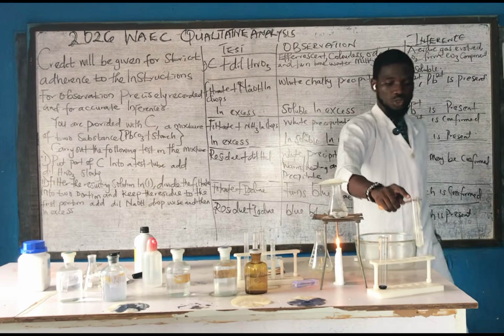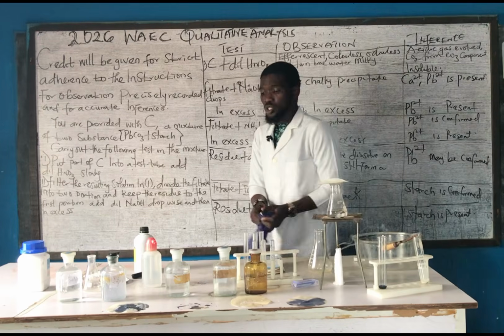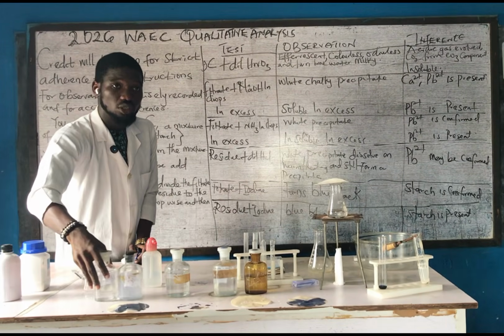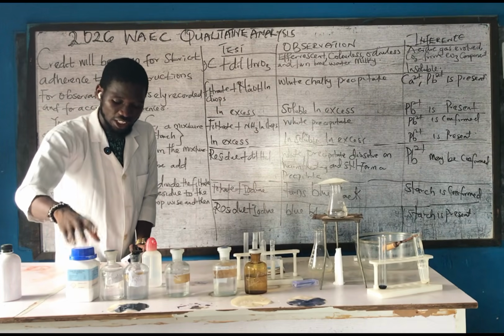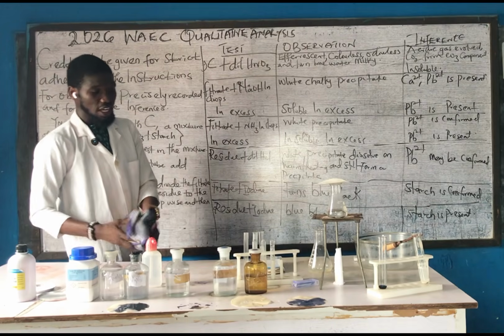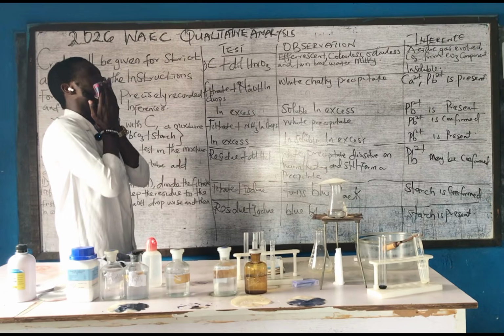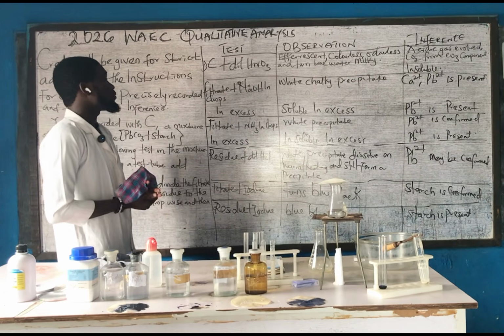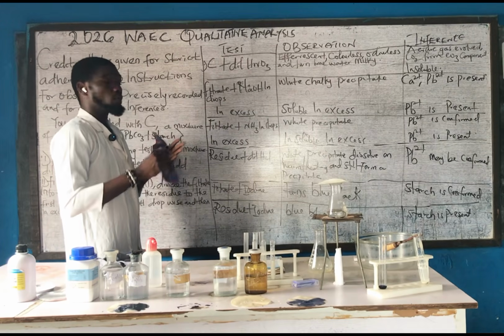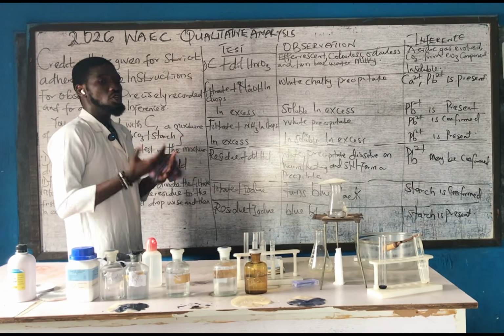So when it comes to the salt analysis test, I want to encourage the tutors out there: there's no magic to how you can easily carry out the practical, just that you need to be careful when it comes to the inference and what you observe. At the end of the video, I will drop a clear picture of the full test, observation, and inference.